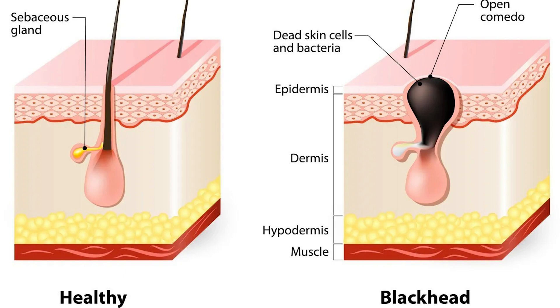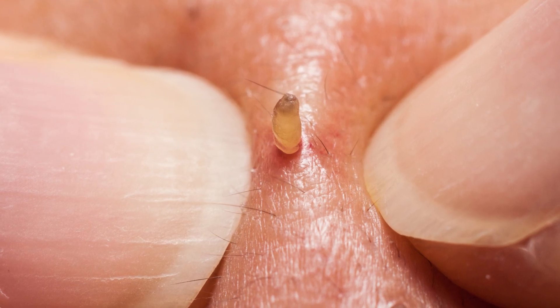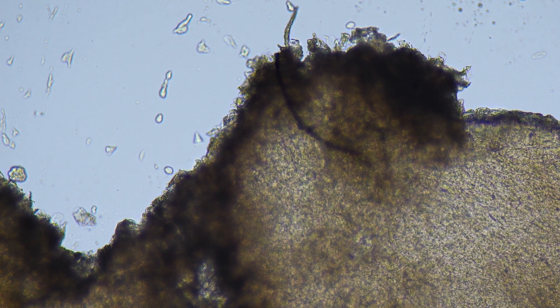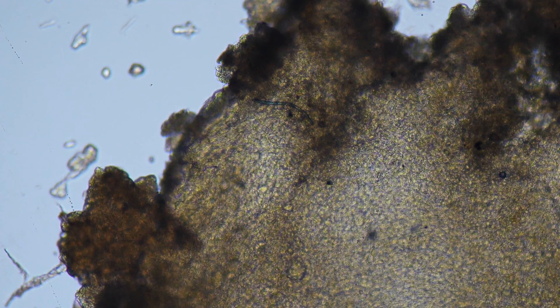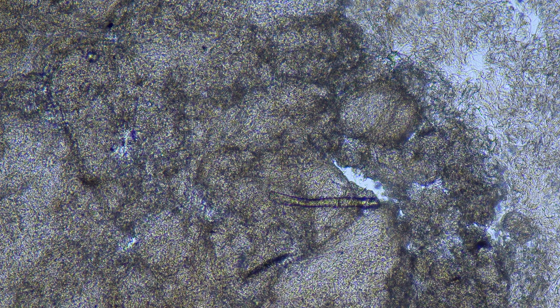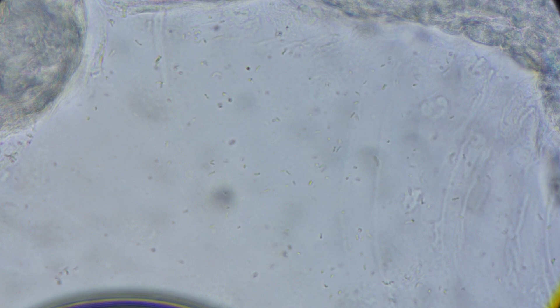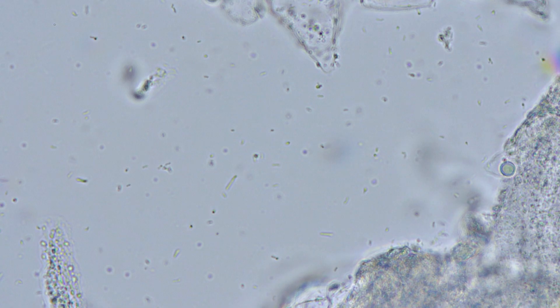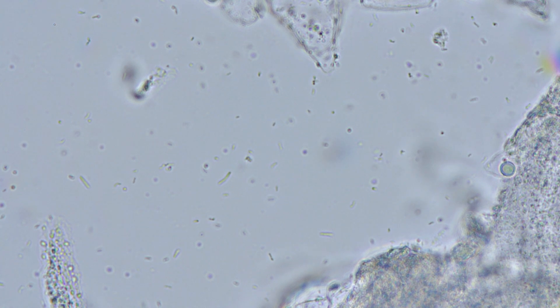Next up is the formidable blackhead, which 100% of people have on their face. When zooming in, we first notice the blackhead's tip, about one millimeter in size. The core of the blackhead is actually sebum trapped in the pore, which oxidizes upon exposure to air and turns black. Under the microscope, we see a dark layer — this is the oxidized part of the blackhead, which is very hard. Below it are layers of white, unoxidized sebum containing a lot of dirt and a few hair strands. At 400x magnification, we see a large number of Cutibacterium acnes bacteria invading the pores, causing blockages that prevent oil from escaping the skin's surface, leading to blackheads.